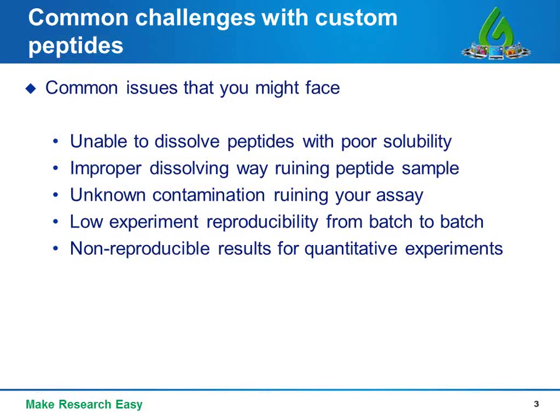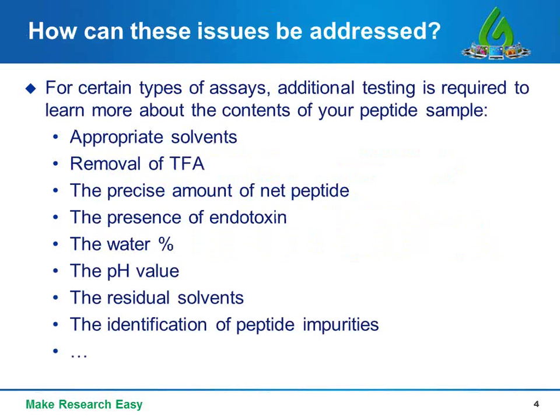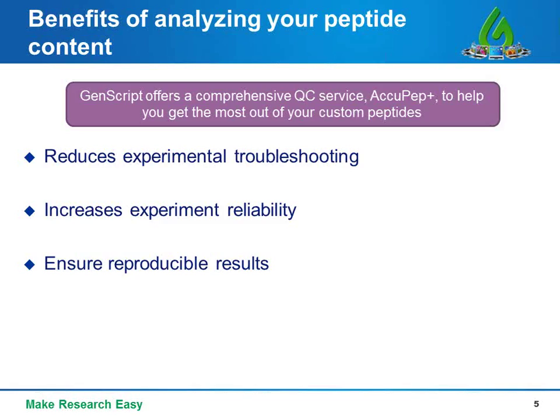Custom peptides play an important role in research, but knowing how to properly use them can be a problem. A common problem is poor solubility — sometimes peptides never seem to go into solution, and improper dissolving may completely ruin peptide samples. Unknown contamination can lead to unexpected results, ruined assays, and low batch-to-batch reproducibility.